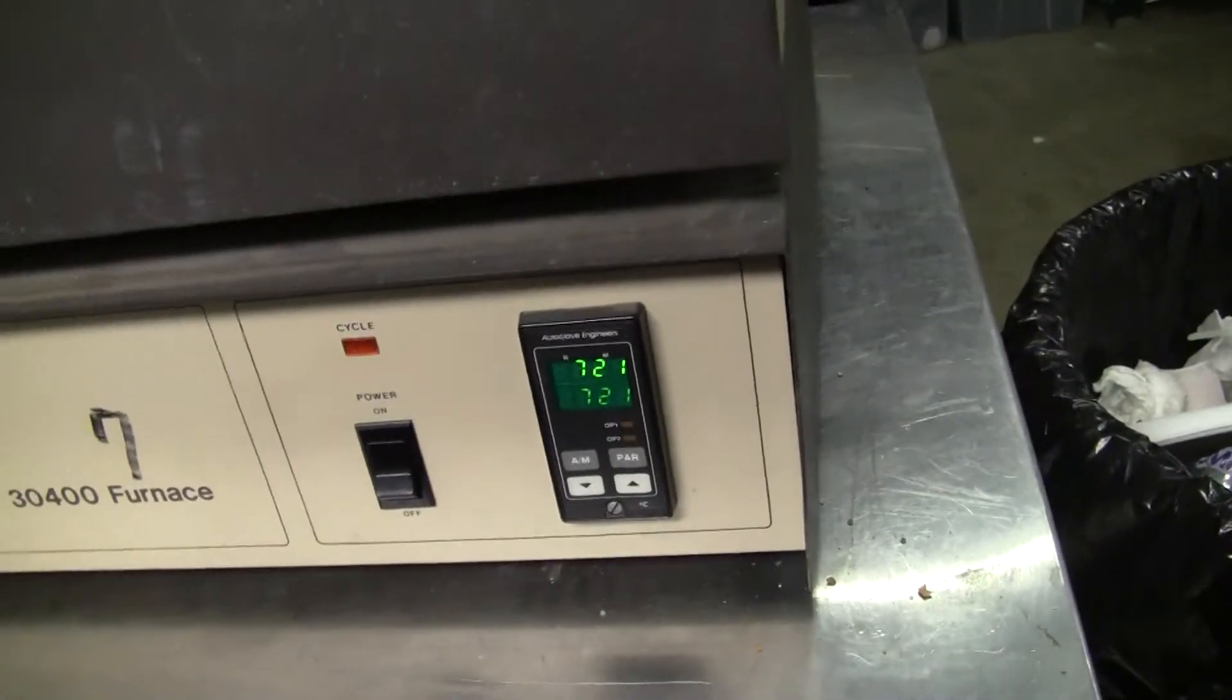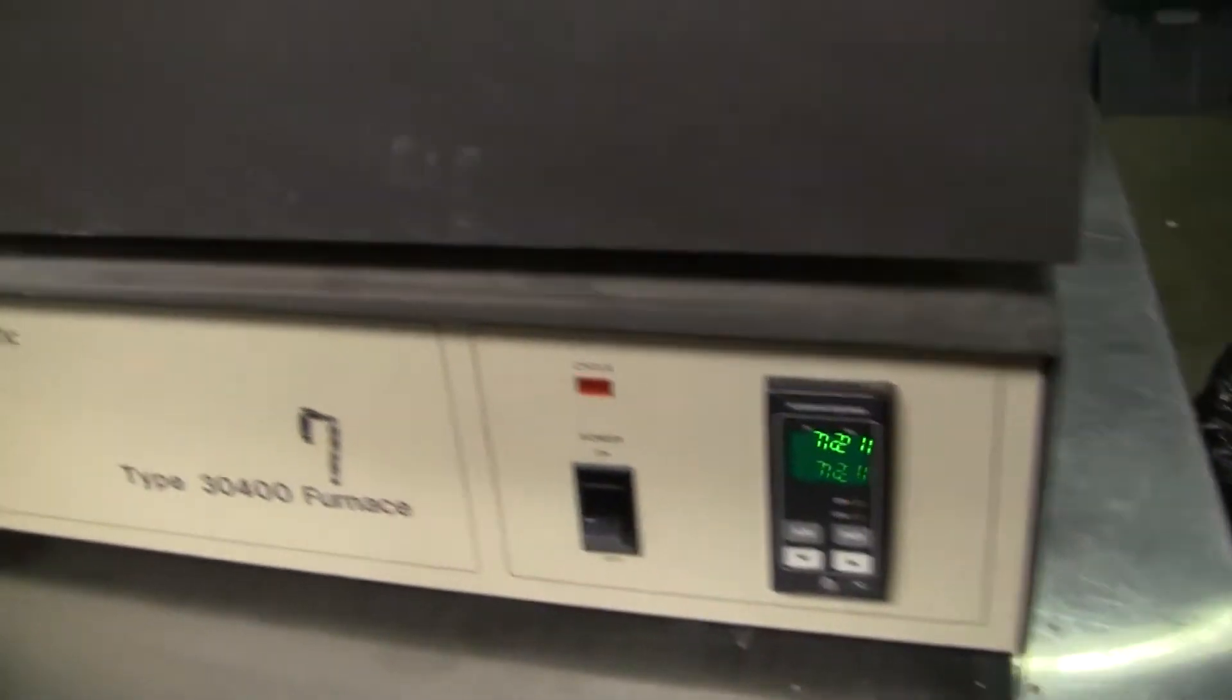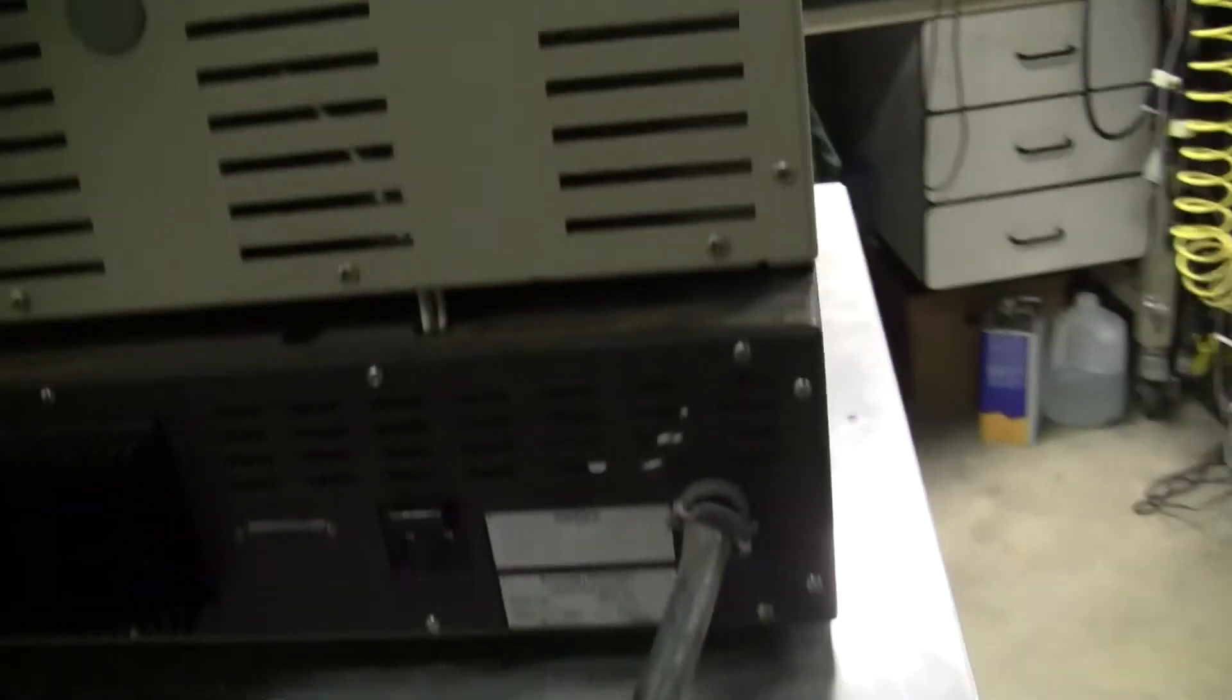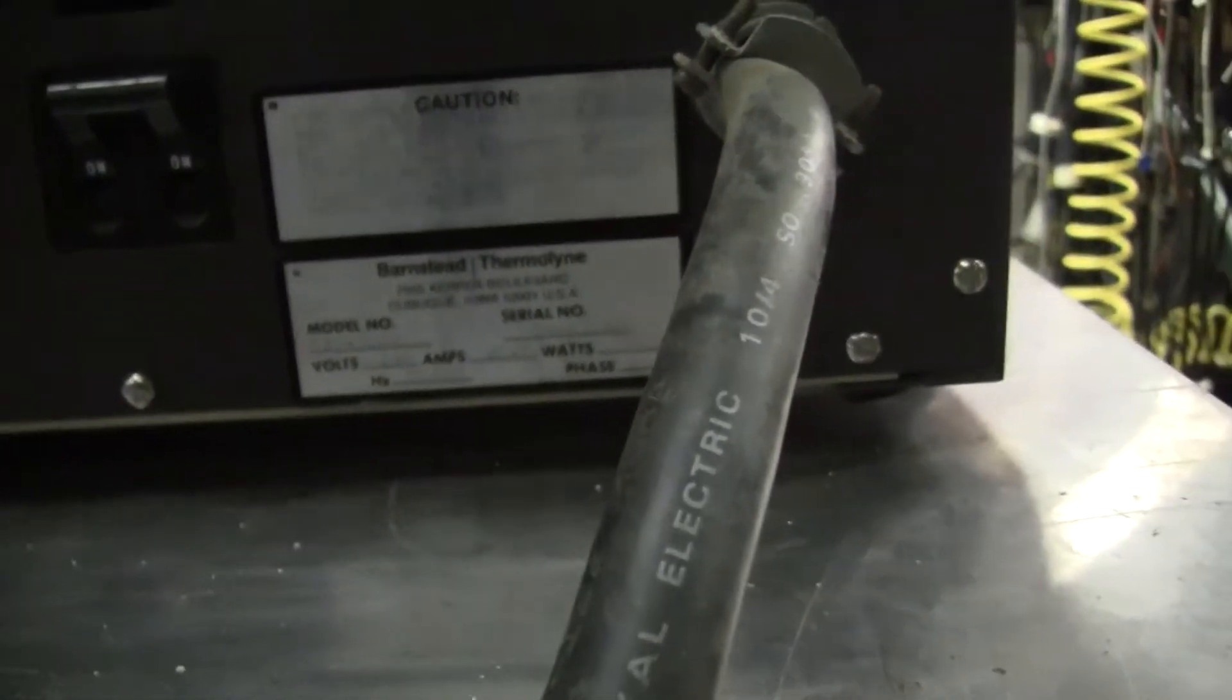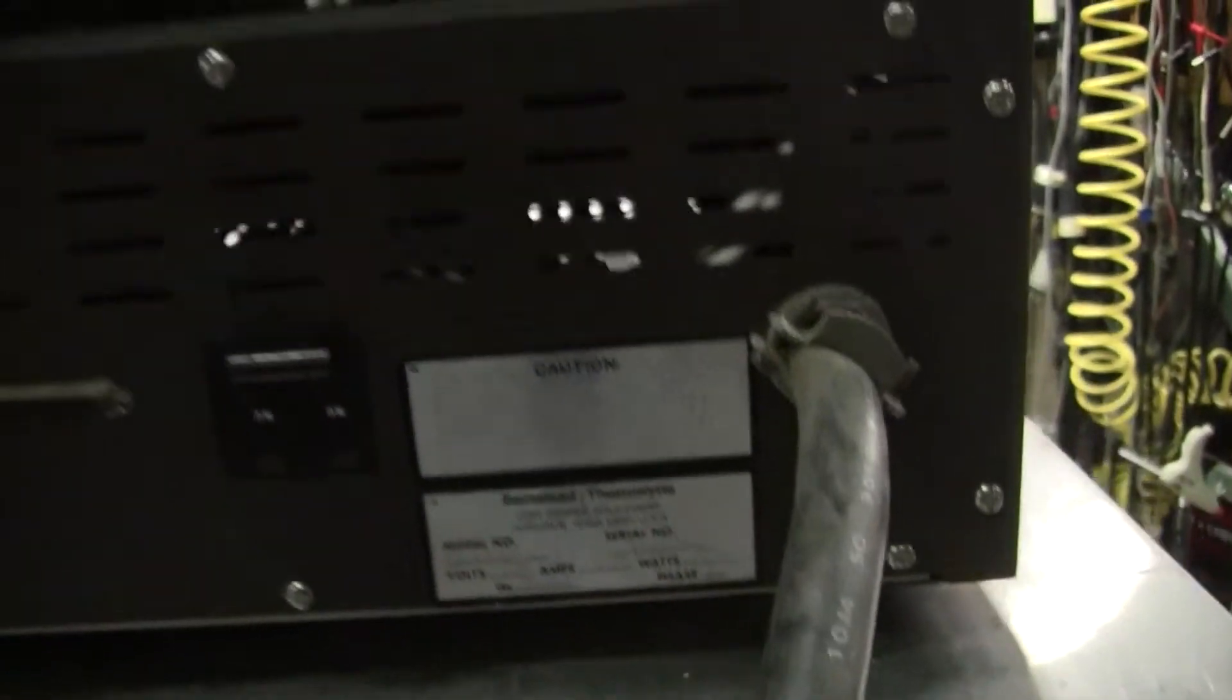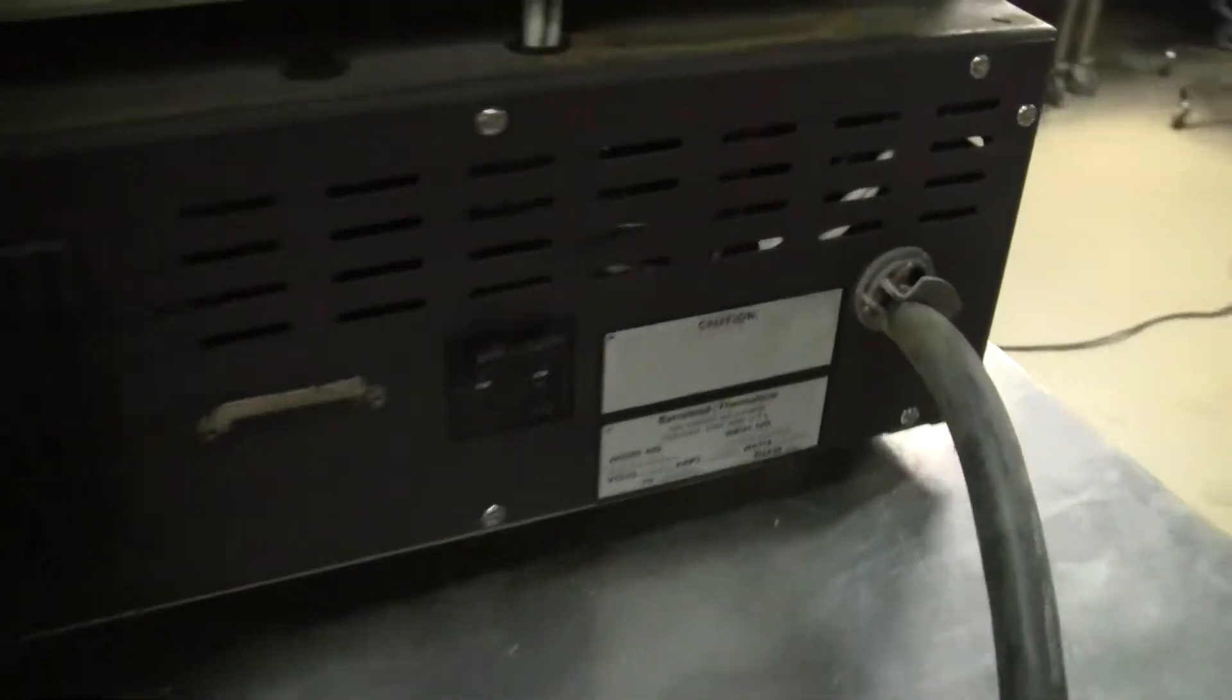This furnace is now cycling at 721 degrees centigrade. This is running on 220 volts. It is a 30 amp circuit, just so when you're putting it in.